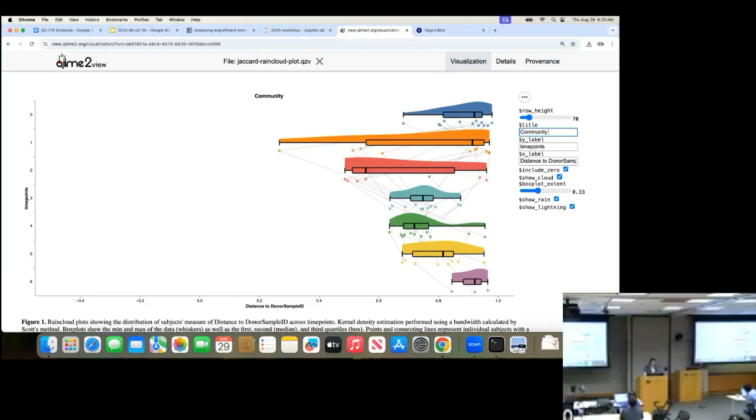And that makes this hopefully really usable for everyone and makes it so that there's just one less step for our users as you guys transition from QIIME to creating figures that you're wanting to publish.